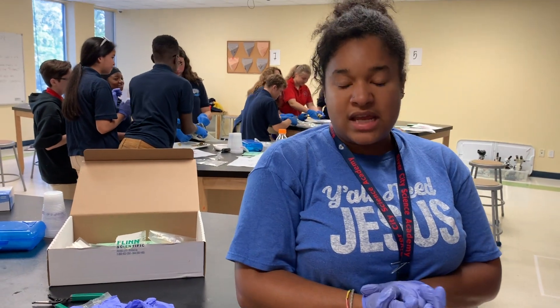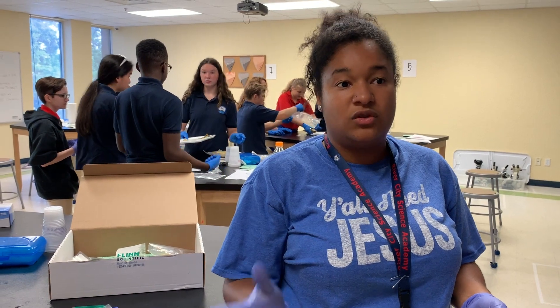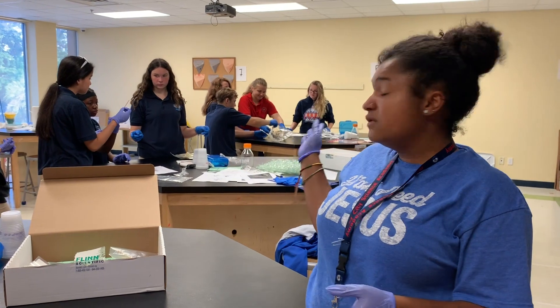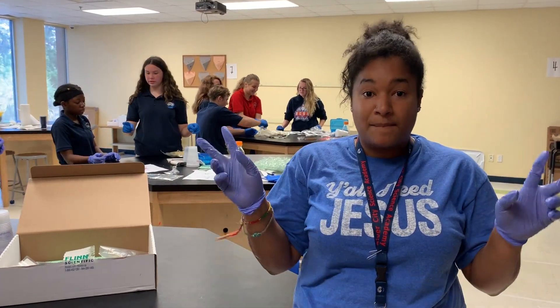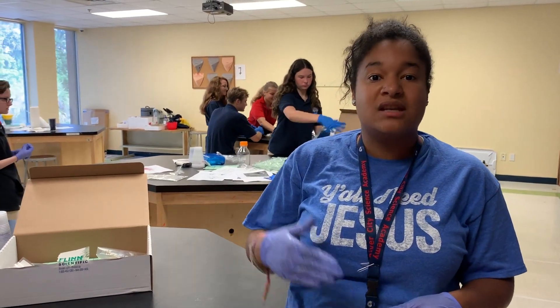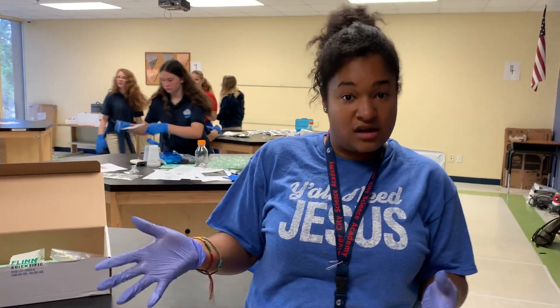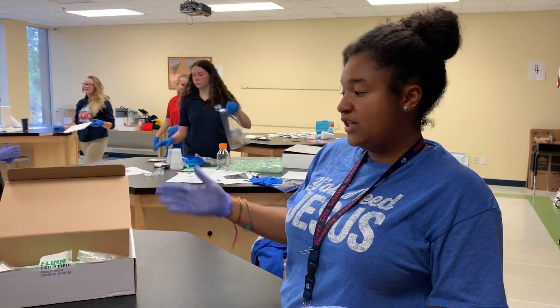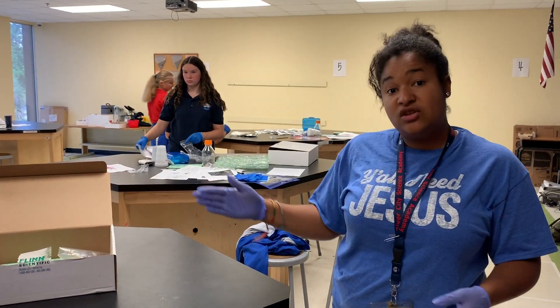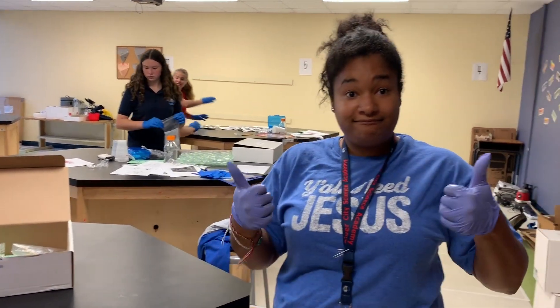Today the students dissected frogs. They looked at the external structures to determine the fitness of the frogs and their adaptations. They also looked at the internal structures to find evidence for evolution — they saw links between organ systems found in humans and compared those to what they saw in frogs. It was a hands-on activity that kept them fully engaged, differentiated so each student had their own task, and they were able to rotate groups. They all had a lot of fun. Thank you.